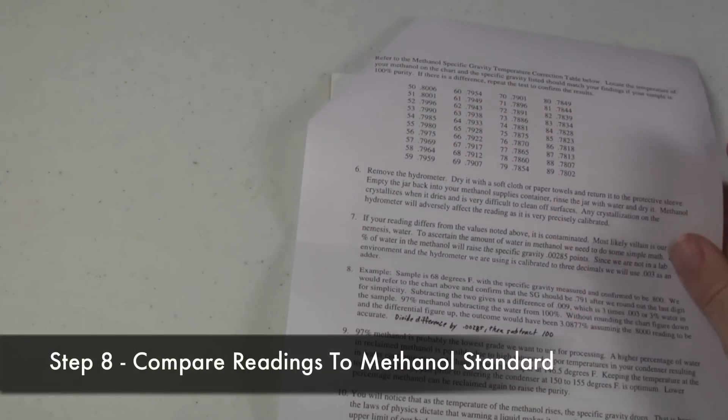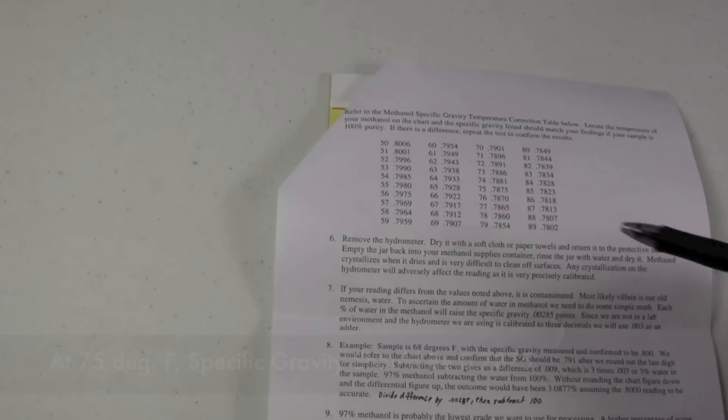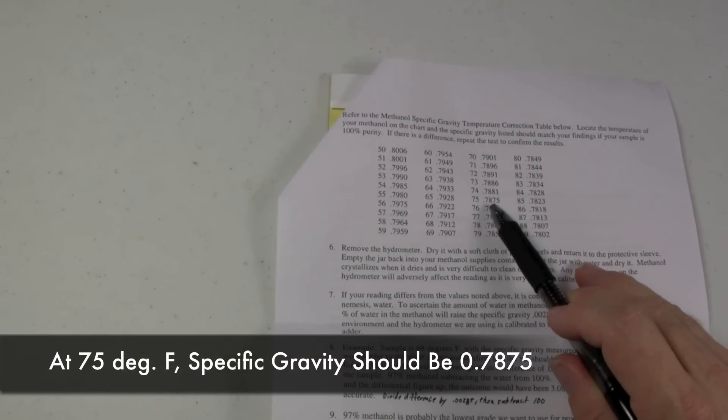What we do is we grab the included chart that comes with our hydrometer, and we look at the temperature. At 75 degrees Fahrenheit, methanol, if it's 100% pure, should be .7875. I think our methanol is pretty pure.